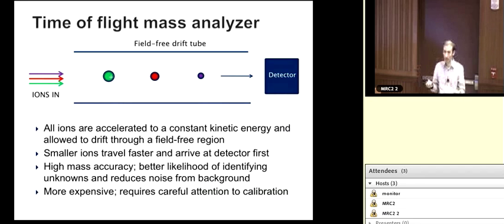And so when you walk into our lab, you'll hear the vacuum pumps humming. That just comes with the territory. Many different types of mass analyzers exist. You may see these in the papers that you read about mass spec. Magnetic sector was sort of where it all began. We've got quadrupole, time of flight, and I'll give you a tour of the most relevant types of these detectors.